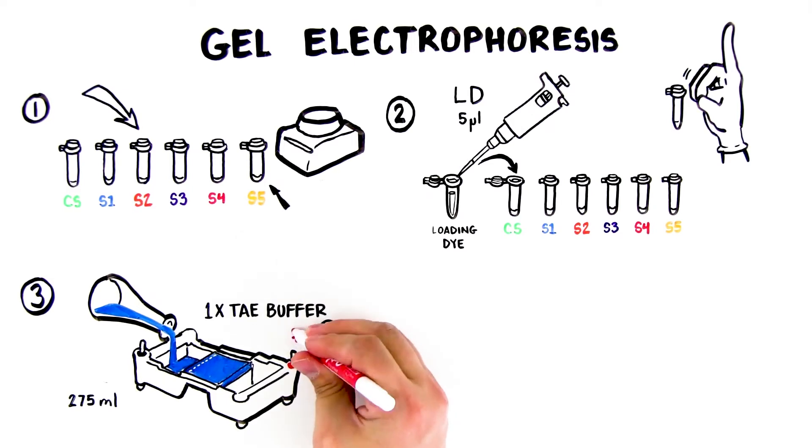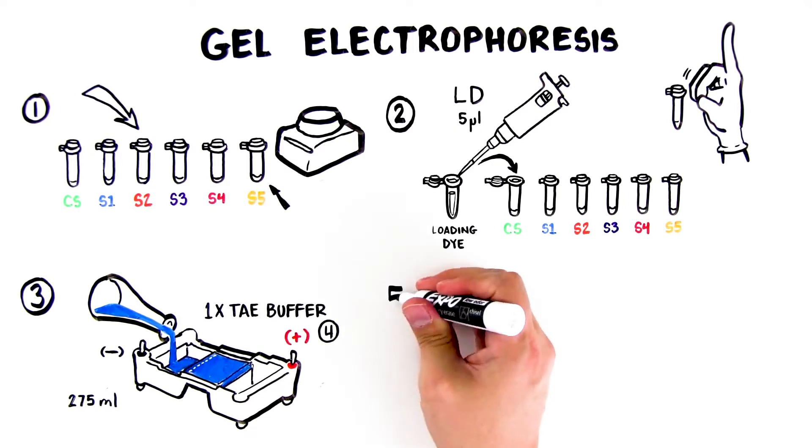Fourth, check that the wells of the agarose gels are near the black, negative electrode, and the base of the gel is near the red, positive electrode.